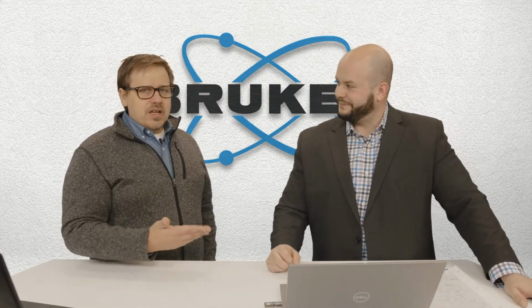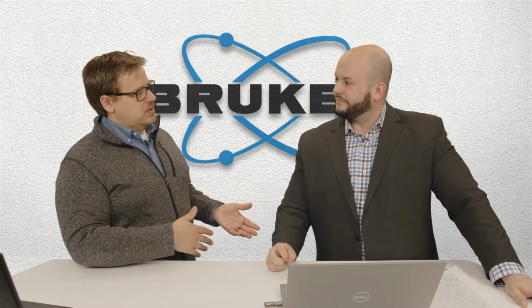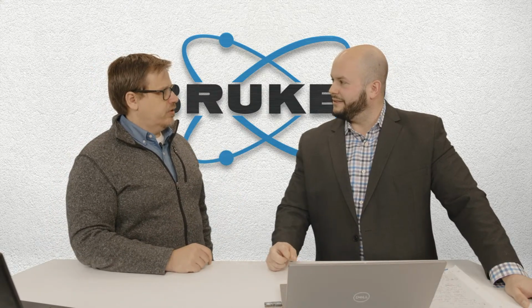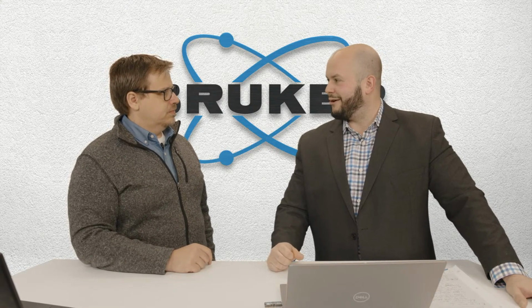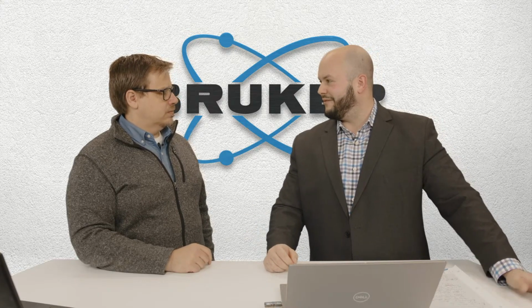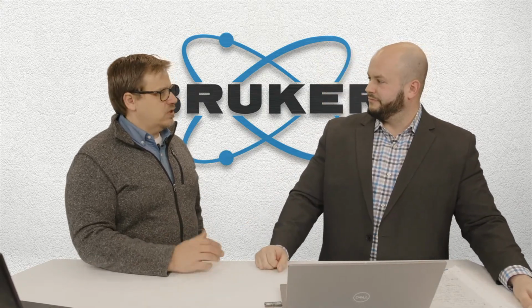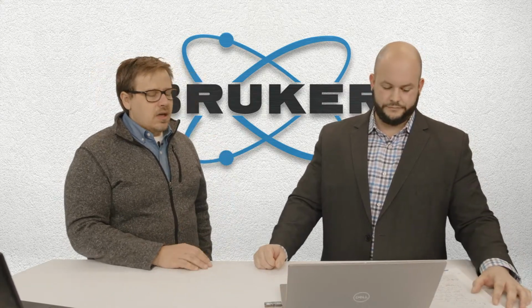Yep. Is there a limit on what kind of materials you can measure? Now, you mentioned you can do amorphous and things like that, but what about things like heavier, tungsten and... Well, that's going to limit your penetration depth, basically, right? Okay. So, the tungsten ends up being a very good scatterer, right? So, high electron density. So that could be a limiting factor of not being able to read those deeper buried layers. Okay, but there is no limit in terms of you need optical clarity, typical ellipsometry.